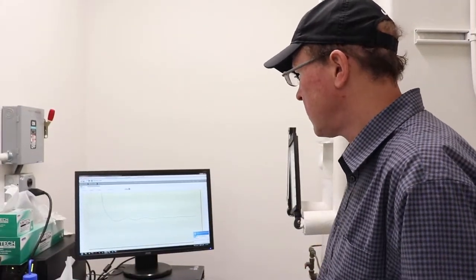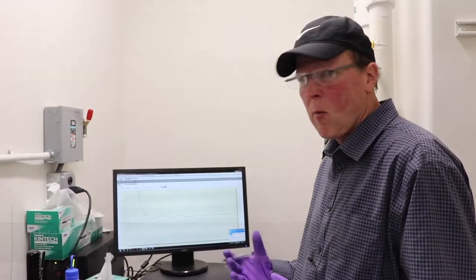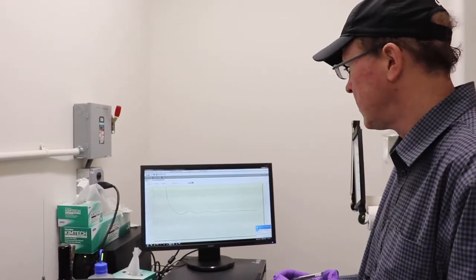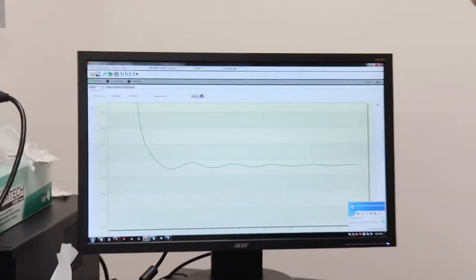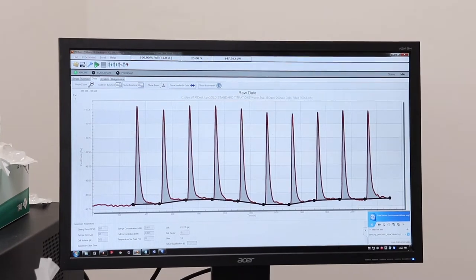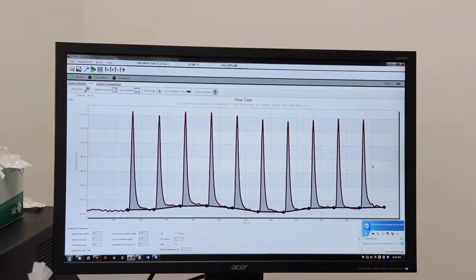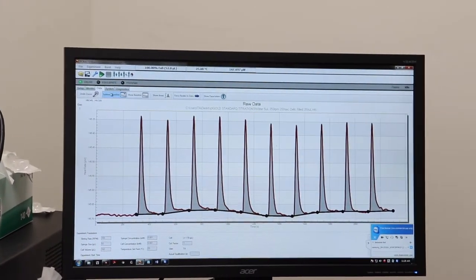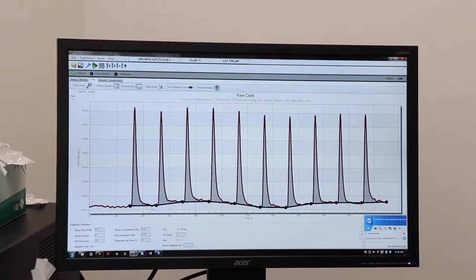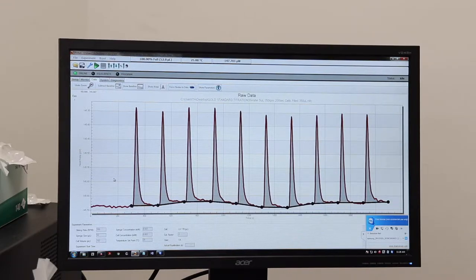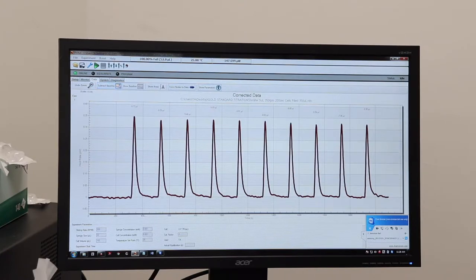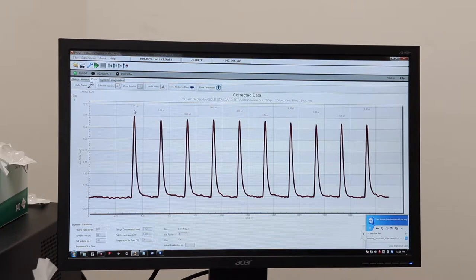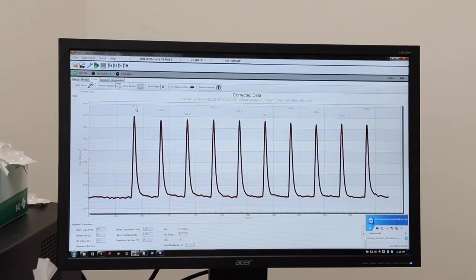Okay, once the experiment is finished, we're going to look at the data analysis for the water-water test and then a calcium into EDTA test experiment as well. So once it's done, you can switch off the monitor tab and go on to data and it should have your 10 injection peaks, one for each of the five microliter injections. It will auto-find a baseline originally, which is here. So if your baseline is pretty good, you can just subtract the baseline. You can modify it by adding or moving these points around. If your baseline really needs a lot of work, you're probably better off just redoing the experiment. So if we subtract the baseline, here we go. It's going to give us our heat per injection, which is about minus 10 microjoules. And that's about right, and all the peak heights are about the same. So for the water-water test, either before or after you use it, that's what you want to see.